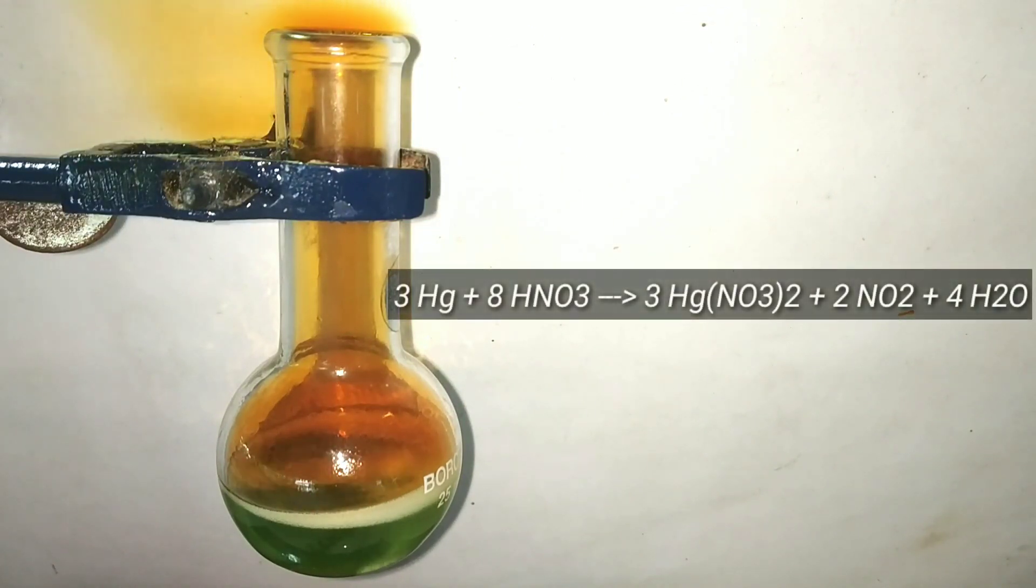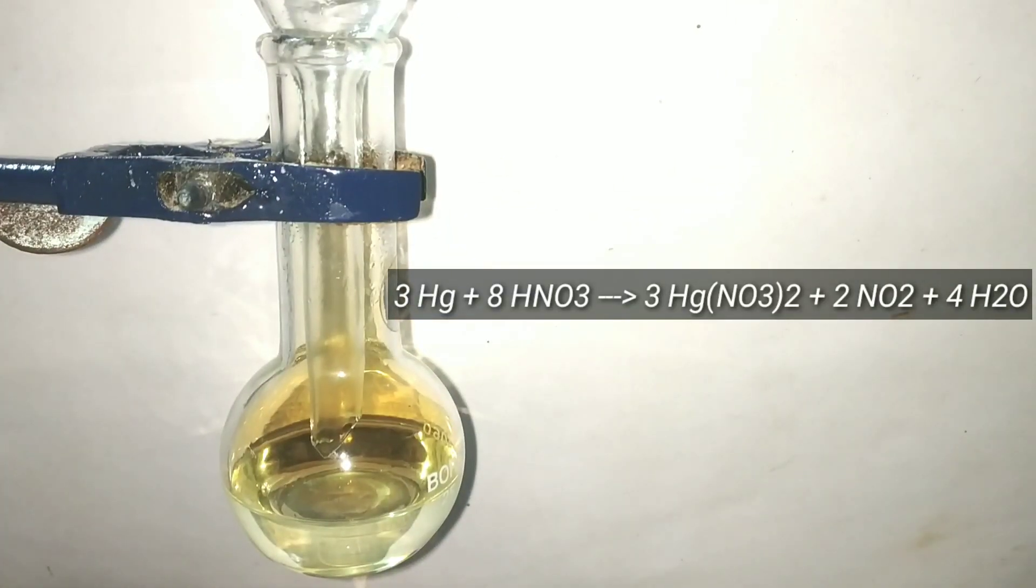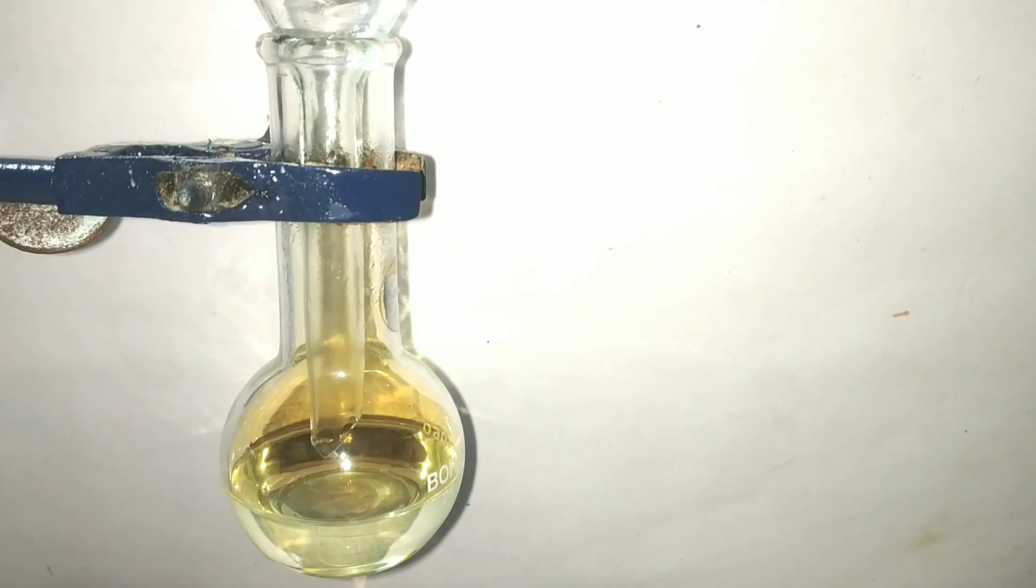But actually the predominant reaction that is going on is given on the screen. Mercury reacts with nitric acid to form mercury 2 nitrate, nitrogen dioxide, and water.